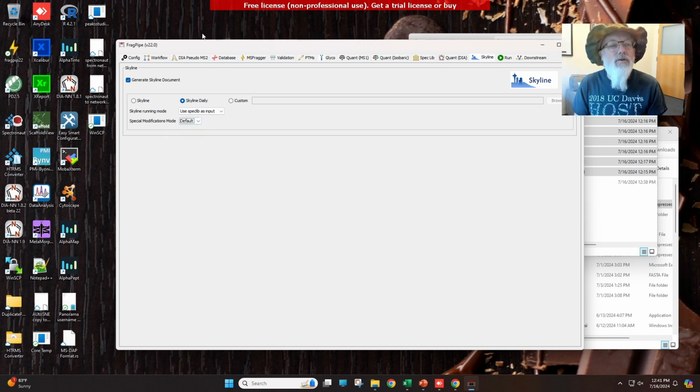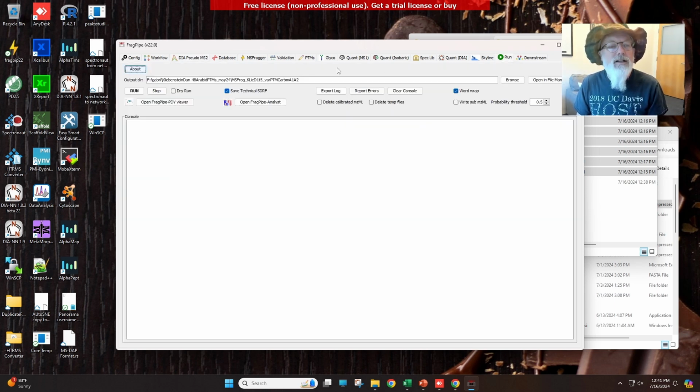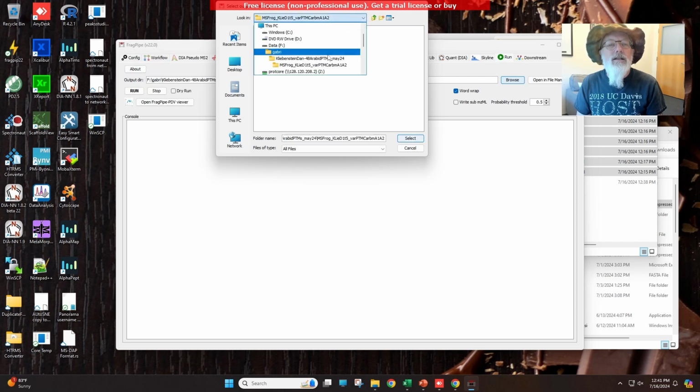Because DIA-Tracer takes a very long time, we are going to start it now, and then I'm going to pause the video and we'll keep going. Let's tell it where we want the output.